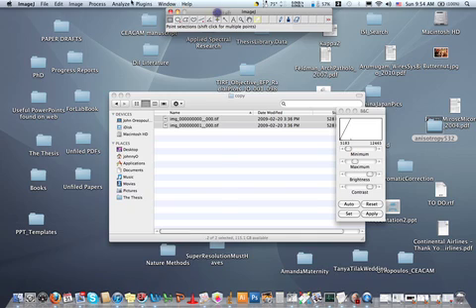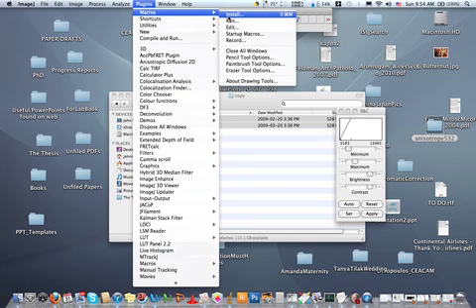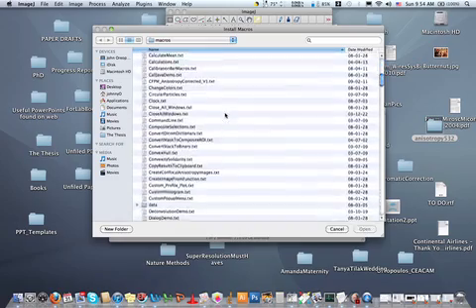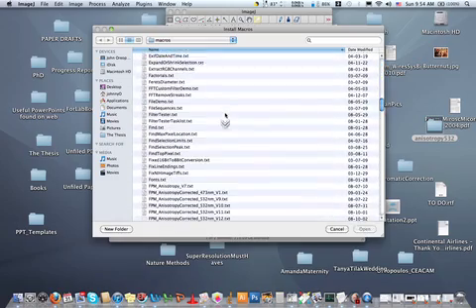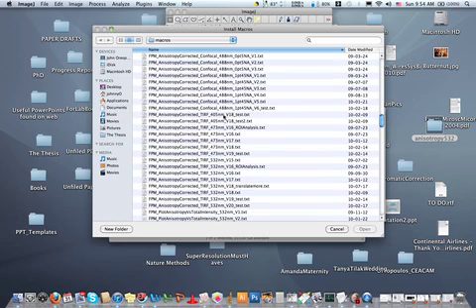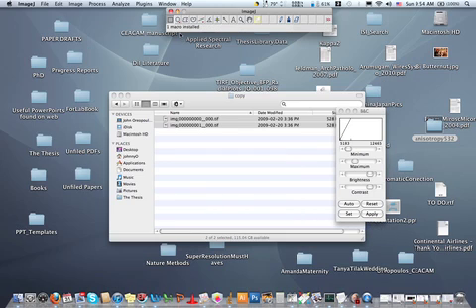First thing to do is to install the plugin. And actually it's a macro. That's the correct technical term here. As you can see, I have many different versions of this, and the one that I'm currently using, and the one that was most accurate, is version 18, and this is 532 nanometer excitation, so that's the one we're going to use. So install it. One macro installed, it says up here.